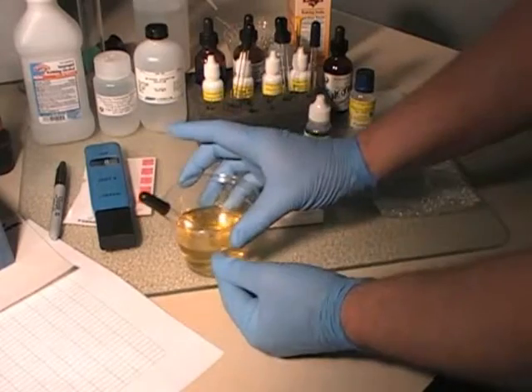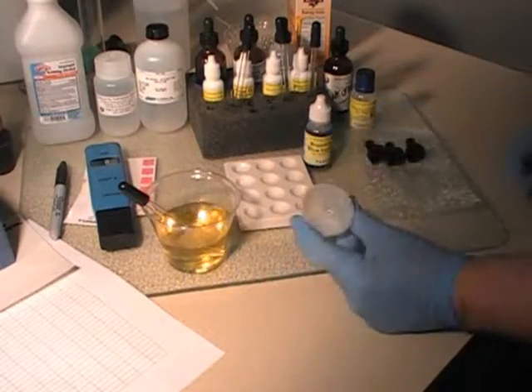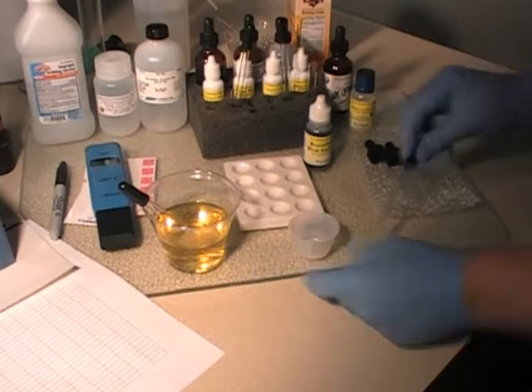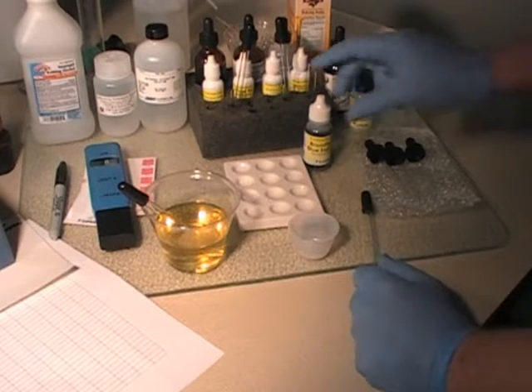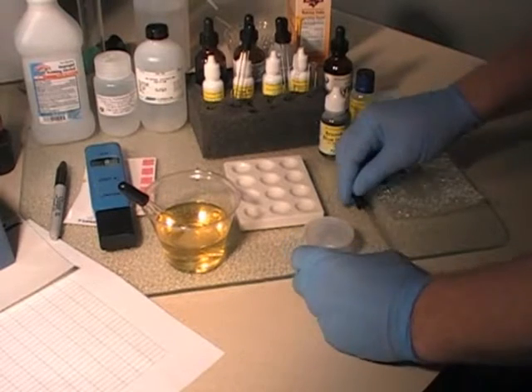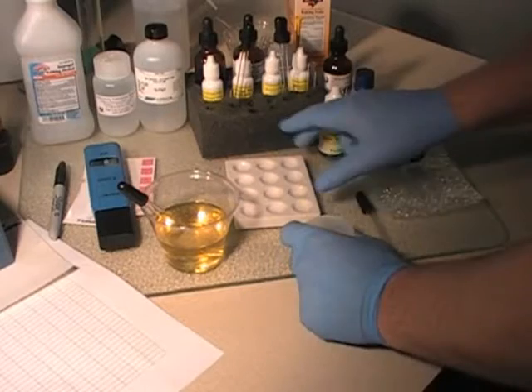that was in the urine. You're going to need your saliva. And you're going to need another pipette. So we're going to take this pipette here. And what we're going to do is use the top row, if we can see the top row okay with the camera, and that's the way we teach it here.